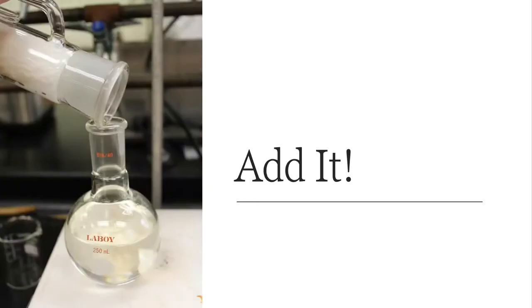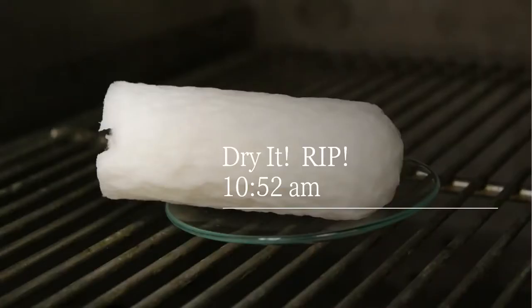So when I take this apart, I now have my Florence flask that's on a hot plate. I'm going to take the Soxhlet extractor and I'm going to pour all of that liquid down into this Florence flask that should have the rest of my peanut oil in it, just in case. Just in case there's more oil that can be found in that last little bit of solvent that was left over. All right, well, my thimble's wet at this point, and I'm going to put that thimble into the oven.